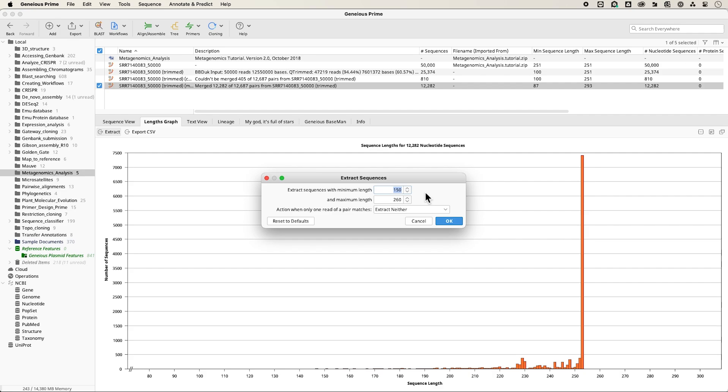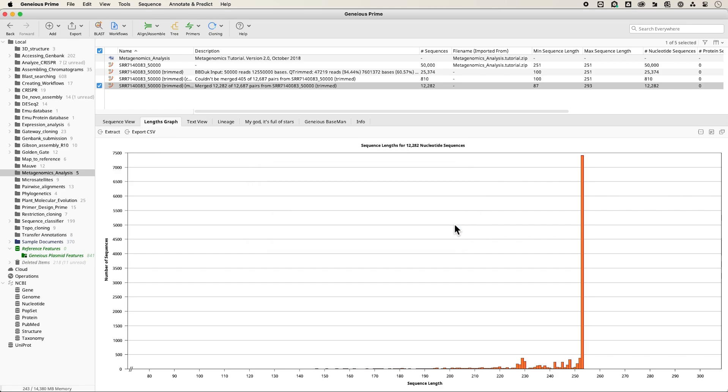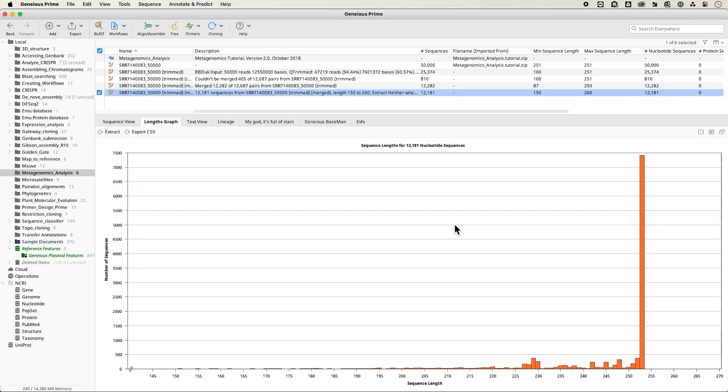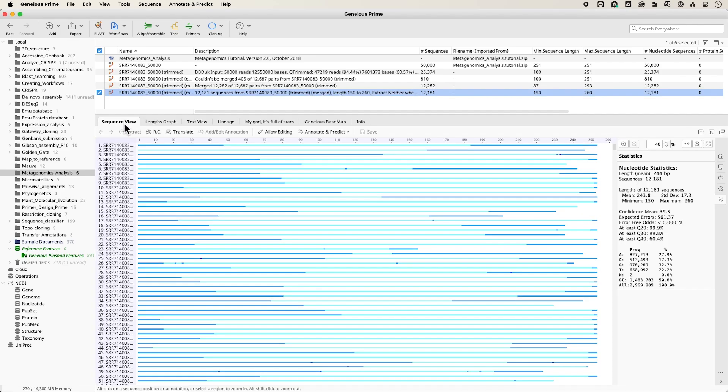Simply click Extract on the length graph and specify the desired range, such as between 150 and 260 base pairs. And that is how you pre-process your Amplicon data in Genius Prime.